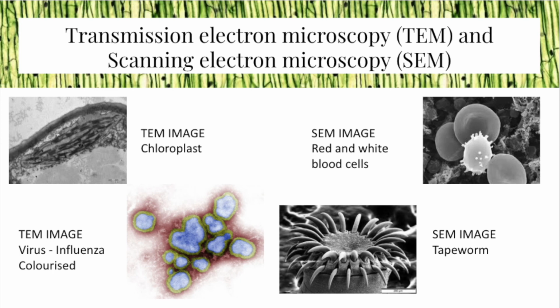From the naked eye to the use of the compound microscope to the electron microscope, technology and techniques for observing cells have changed significantly. The introduction of the electron microscope has allowed for a greater understanding of the subcellular structures known as organelles.